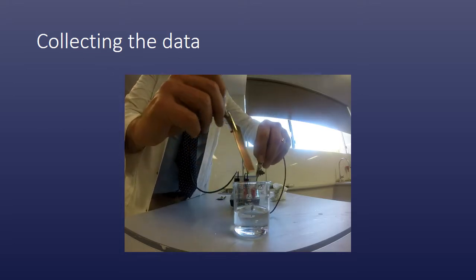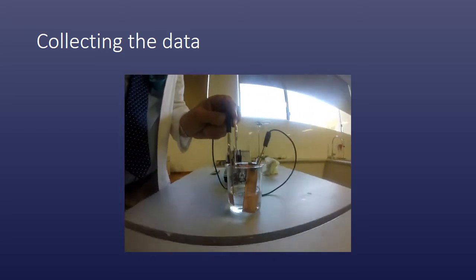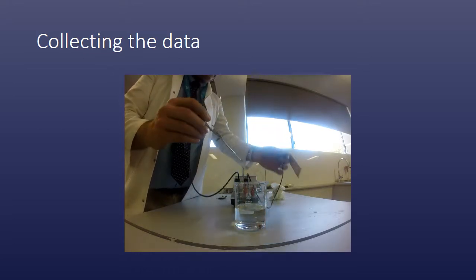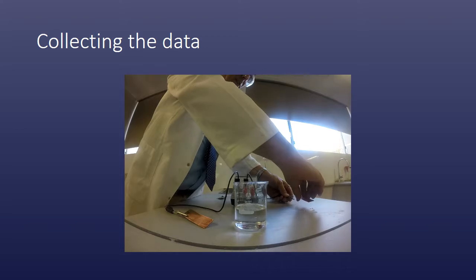Okay, it's actually giving me a slightly negative reading at the moment, but nothing much is happening. Certainly not what was happening when I used the zinc. So this could be a bit of a problem, or it could be telling us something about what happens in a galvanic cell. In this case, the two metals are identical. They're both copper, and so nothing much is happening as a result of putting both of those metals into the same solution. So having a different metal obviously seems to be one of the key things that I need.